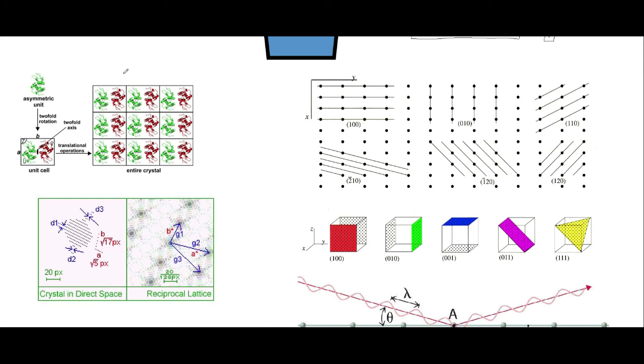And these unit cells form into this lattice with these repeating unit cells. And so these unit cells end up with what are called the Miller indices. What that would be is something like we have a certain atom right here, and then if we go down to the next cell over here, we have that same atom here, and then that same atom here.